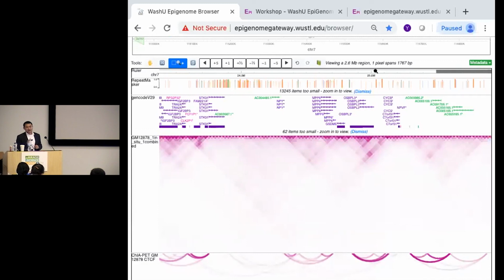That function is not fully developed, which means there are lots of features that we want to have. We haven't developed them, which is why we haven't published. We have the basic bare bones ready.